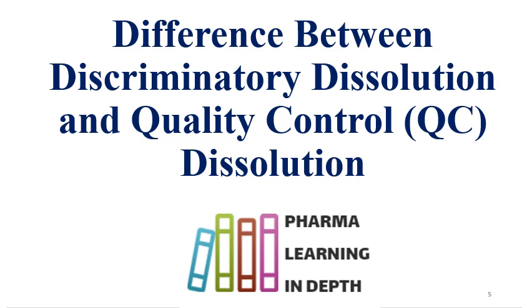So this is the small video regarding the difference between discriminatory dissolution and quality control dissolution.